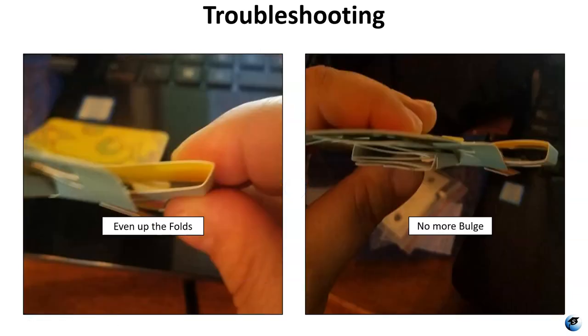Another problem was that the folds were just not even enough — they weren't crisp, clean folds. I took them and reshaped them with my fingers until each fold was much more square, and then my bulging issue was resolved. No more bulge.